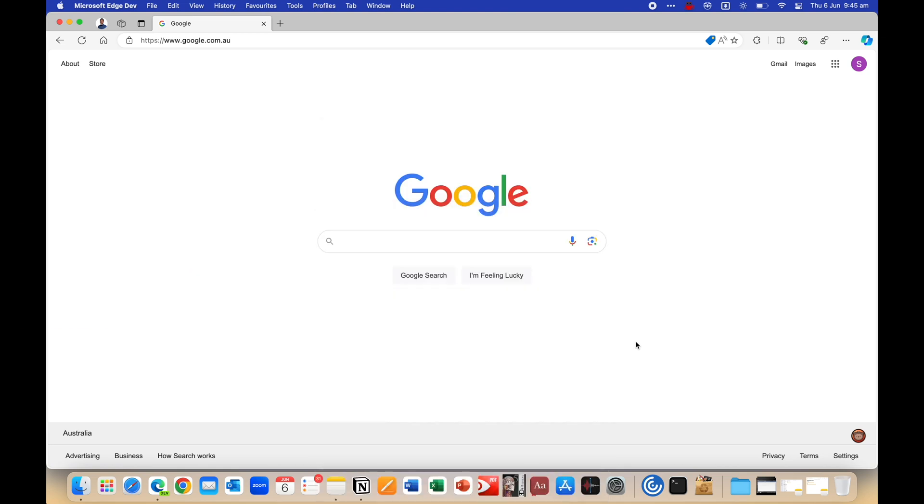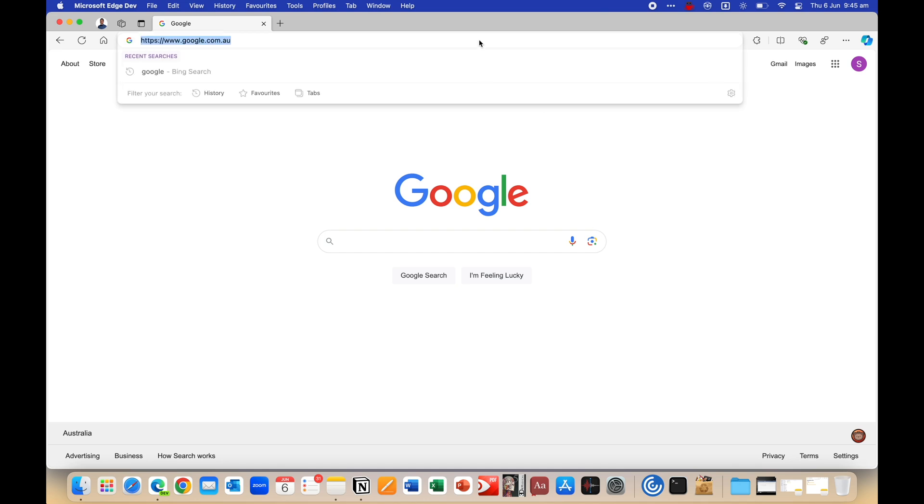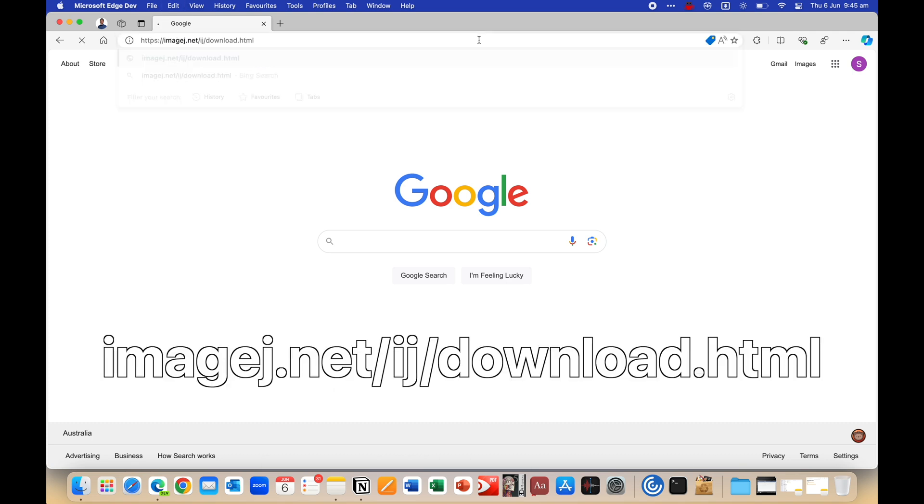Let's start off with the Mac first. Now just a note, ImageJ is a legacy software and Fiji is just the same thing, but with a bunch more plugins and functionality, but for the most part, ImageJ should work fine. Alright, so open up your browser and head to this link. I'll also leave a link down below.